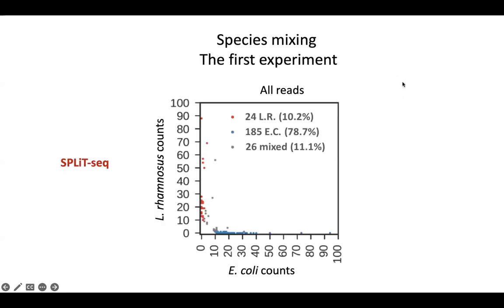All right. So what I'm going to show you now is a bit of a process engineering pipeline, which you typically don't always see in the successful papers. This is our first historical experiment, just applying split-seq as is to bacteria. We wanted to see how the basic eukaryotic method, without any adaptations, would fare for bacteria. And we've got some data. So here's E. coli, and then we used Lactobacillus rhamnosus as our gram-positive, just for one experiment. We did have some clusters, but it is pretty poor.